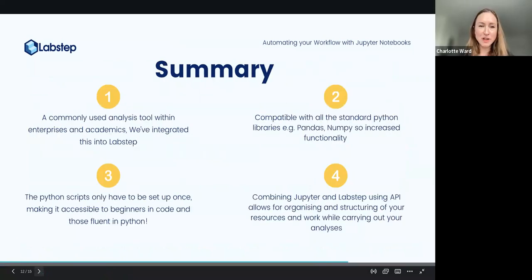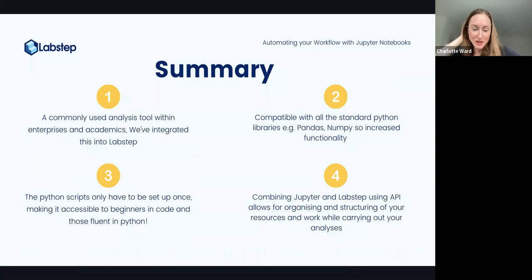There's been a great conversation going on in the chat about the different libraries. Thanks to all who've been involved in that. I'm just going to read out what Barney's written, because I think it's a really good point to make: some of the standard libraries, pandas, matplotlib, numpy and scipy, are already there and installed.